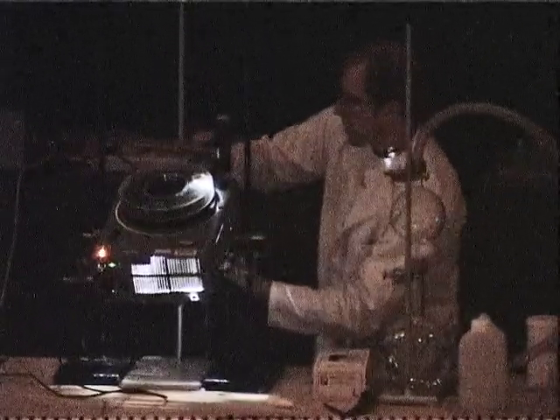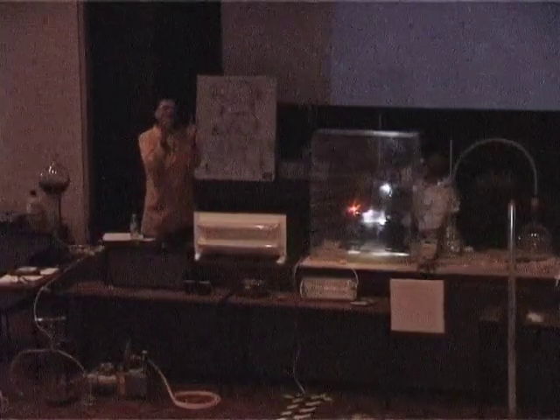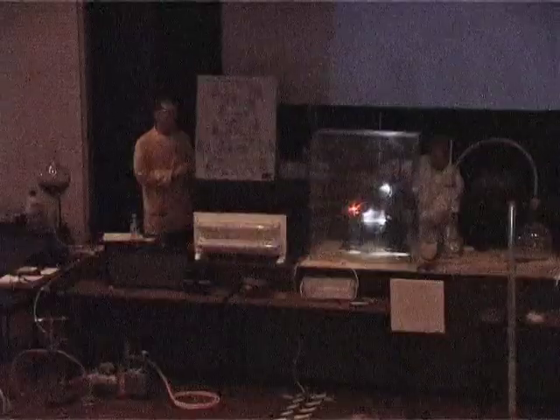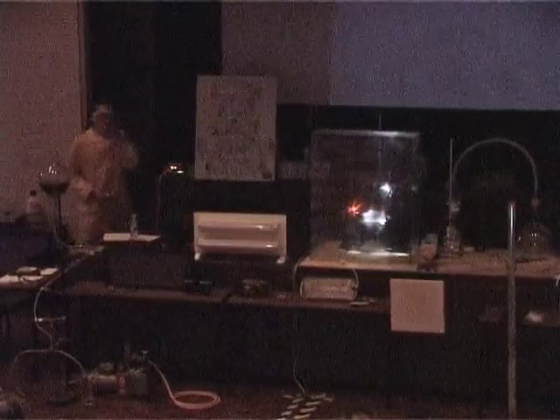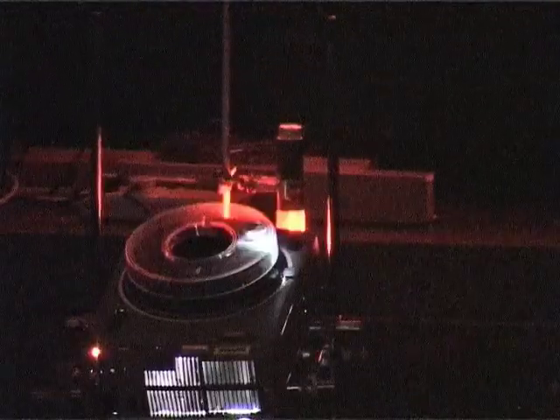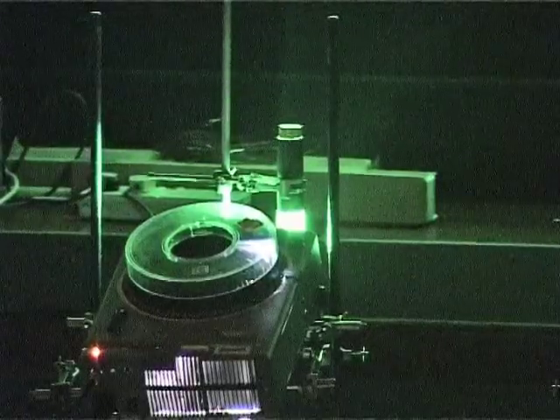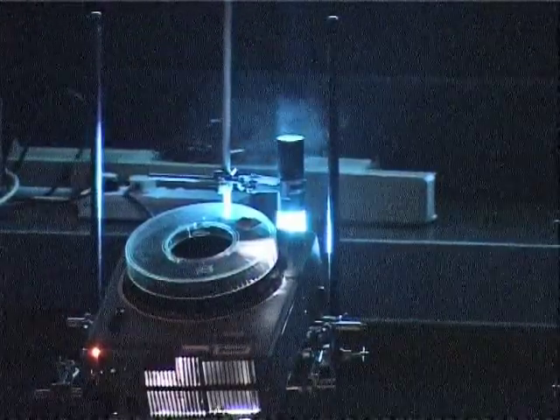Okay? So with some light shining on this mixture, the light has enough energy to break apart the chlorine molecules into chlorine atoms, and this starts a rather vigorous reaction. Okay? So, are you ready? Okay, first of all, let's try some red light. No reaction. Some yellow. No reaction. Some green. No reaction. And some blue. Oh, there we are. Good.